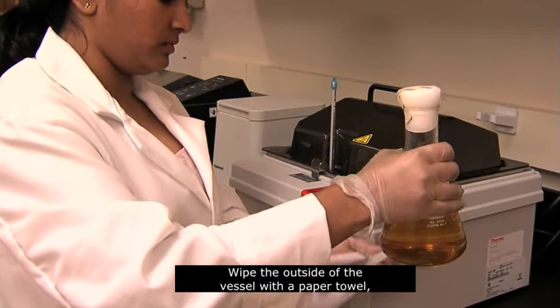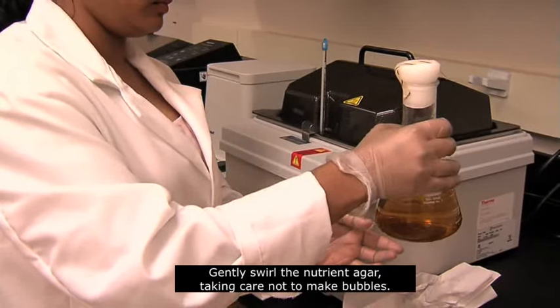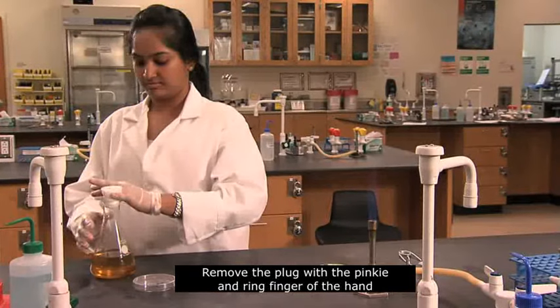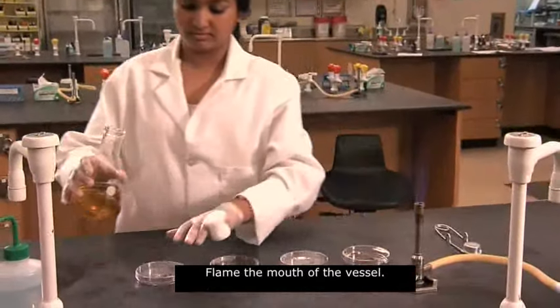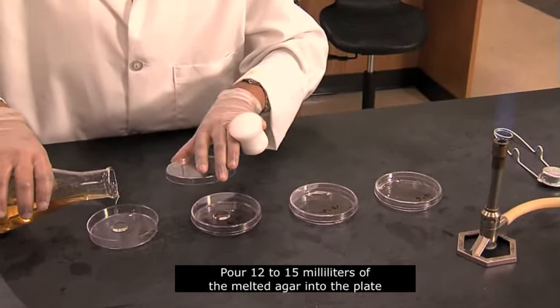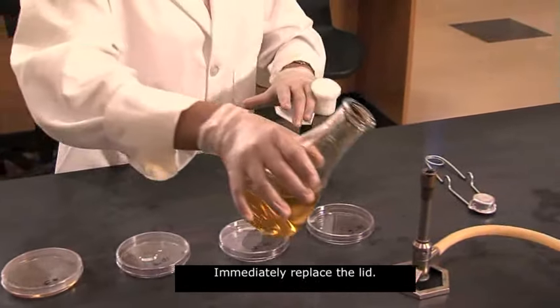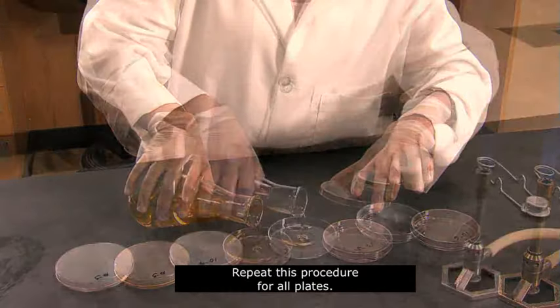Wipe the outside of the vessel with a paper towel, being careful not to contaminate the mouth. Gently swirl the nutrient agar, taking care not to make bubbles. Remove the plug with the pinky and ring finger of the hand that lifts the plate lid. Flame the mouth of the vessel. Use your thumb and forefinger to remove the lid from the plate. Pour 12 to 15 milliliters of the melted agar into the plate so that it is about one third full. Immediately replace the lid, then swirl the plate gently. Repeat this procedure for all plates.